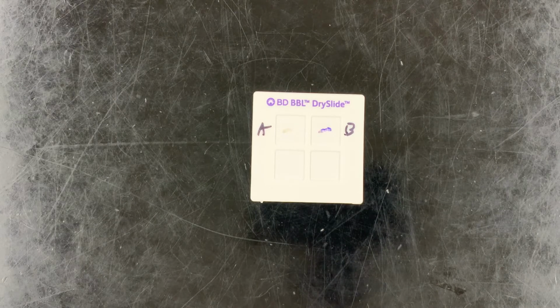All right, but in this case, a positive result will turn our disc purple, right? And you can clearly see that B is turning purple. So based on what I said, which of these two bacteria is the enteric bacterium? Which of these two is the non-enteric bacterium? Okay, so I'll let you guys try and figure that out.